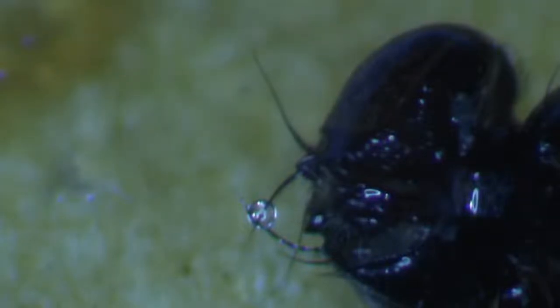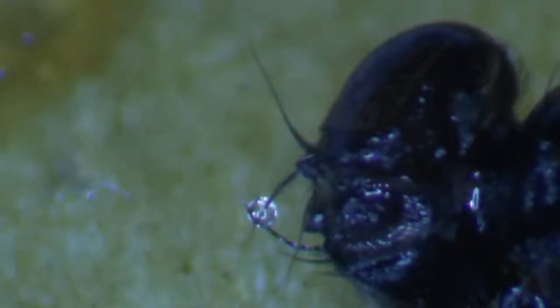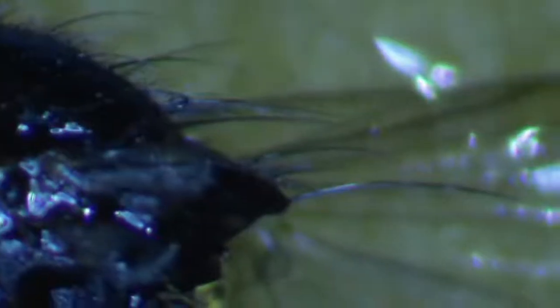Don't know if I can get any more light on this damn thing. Let's see. There we go. A little more light. And such. There's all the wings attached. I need to find a better specimen.